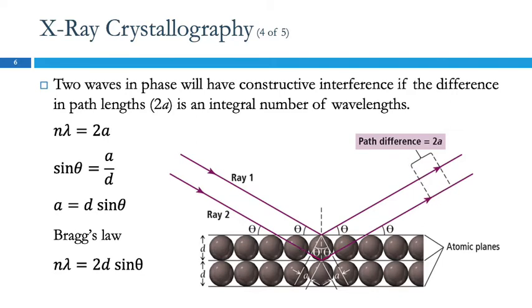Let's highlight that. It goes from here to here, farther than the one that bounces off the top atom. And you can calculate that using Bragg's law.